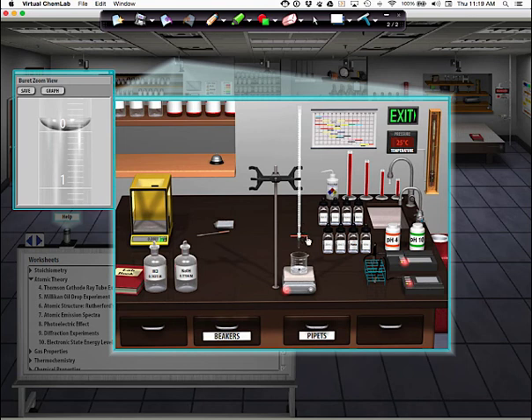Okay, so let's zoom in here so you can see how this goes. And let's drain this down to 9. And you got to be quick. It's always better to stop a little early than wait too long. Didn't turn pink, so we're okay, right? Then what we're going to do, guys, is we're going to let this add drop by drop, being super ready to double click as soon as we see pink. So here we go. Drop by drop, it's going in. Done. That's it. I caught it exactly at the point where it turned pink. And guys, we are now done titrating.